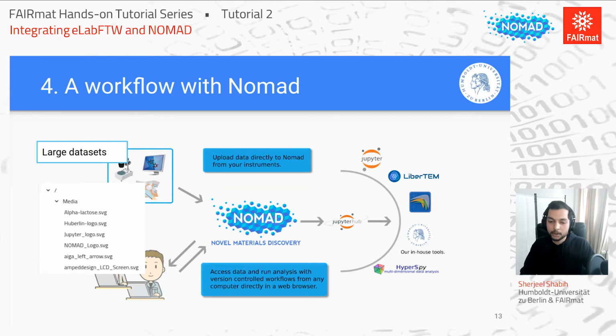And most importantly, once we have data at the experiment level, once we're working with the project, it makes it easier to finally publish it to NOMAD and make it available as part of our publication, because it's already been processed and documented in a nicer way. And this brings us to the main idea that really aligns with what our lab wants as well, because NOMAD is supporting FAIR data. It means that all the ELN capabilities also lean on that FAIR idea and make sure that everything is well documented.